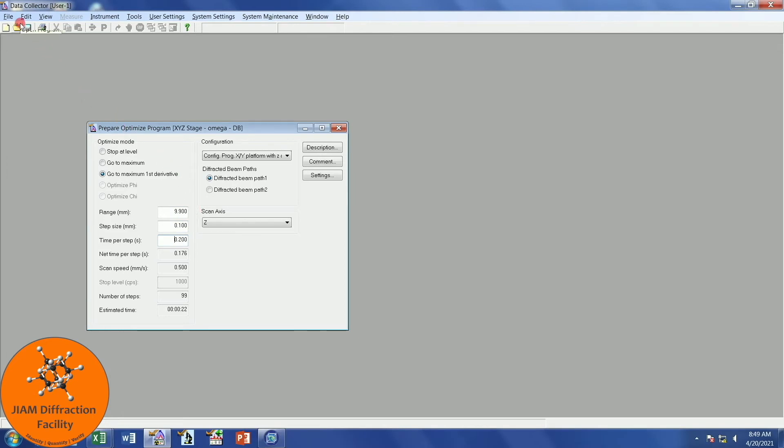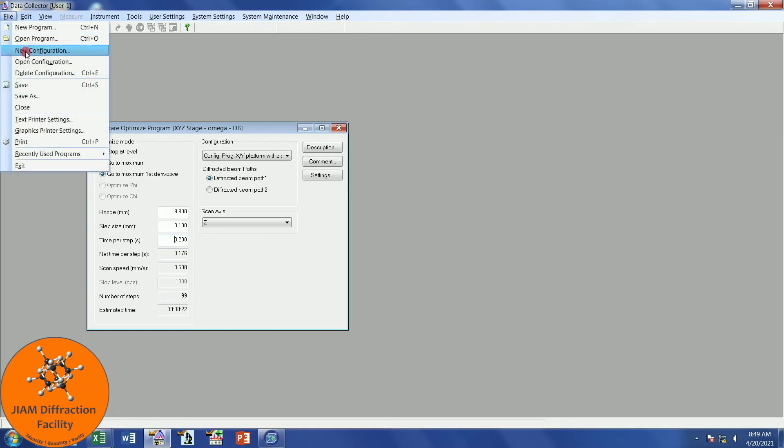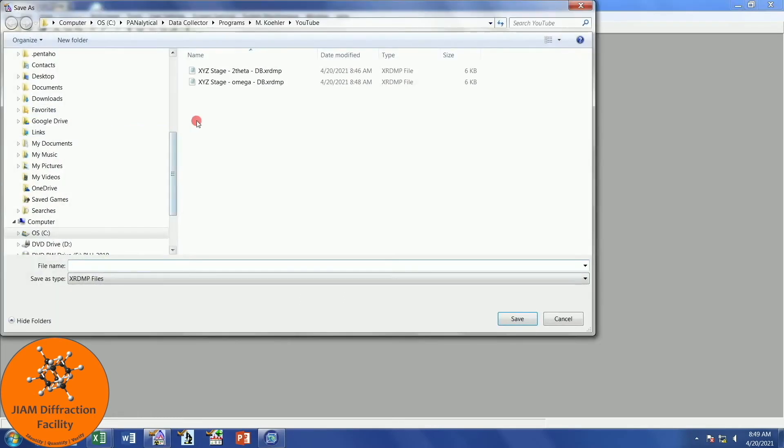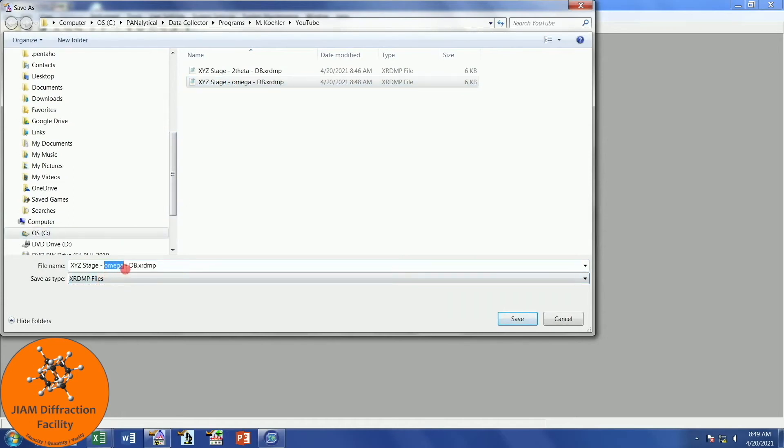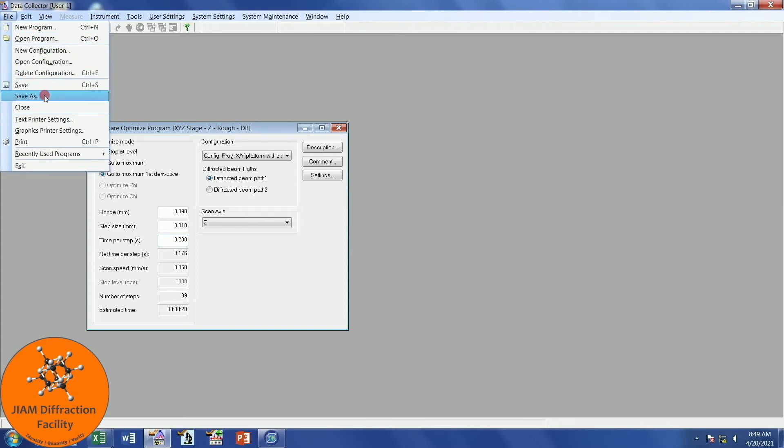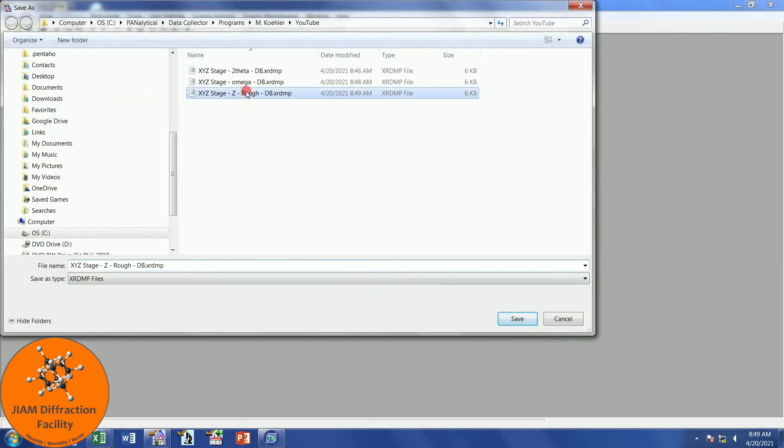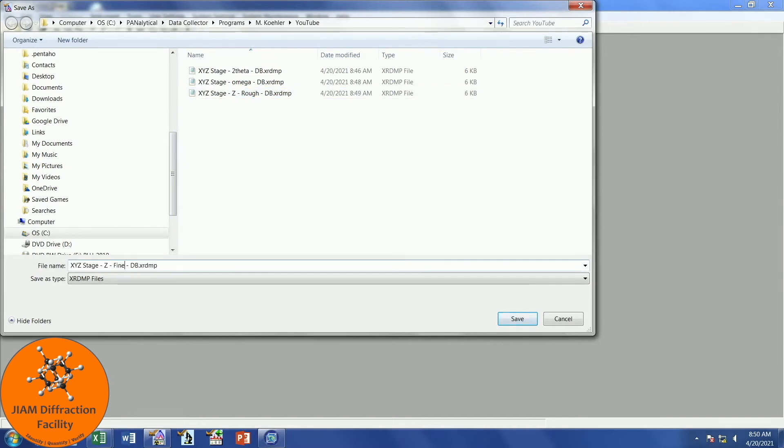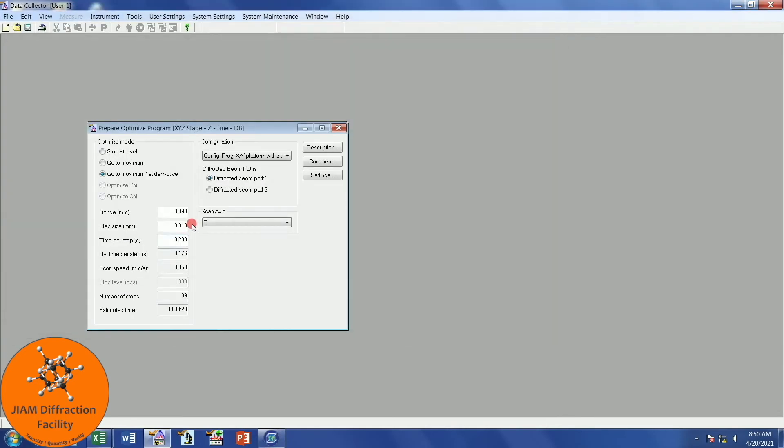Let's go over here to File, Save As. I'll click there once. Change this to Z Rough. Enter. And then once this rough scan gives us an approximate position that we need to be at for our sample, we can now change this to 1 and 0.01 to do a finer type of scan. Come up here. File, Save As. Left-click that. Change this to Fine. And Enter.